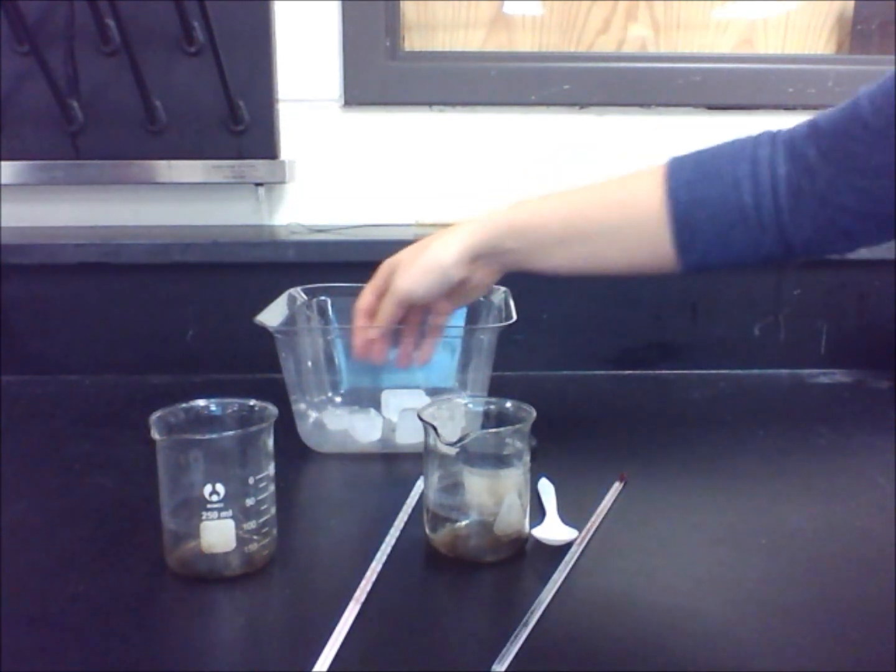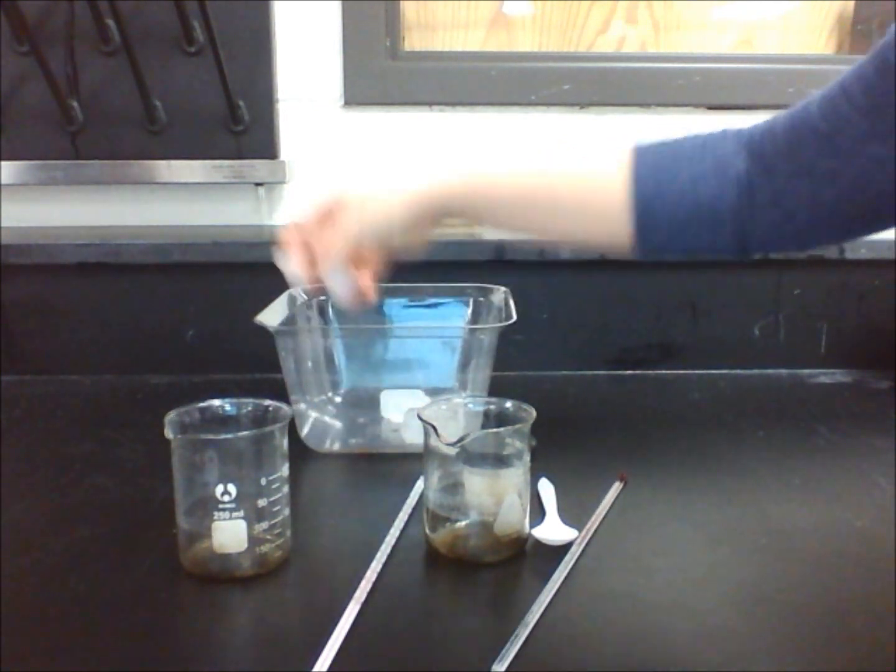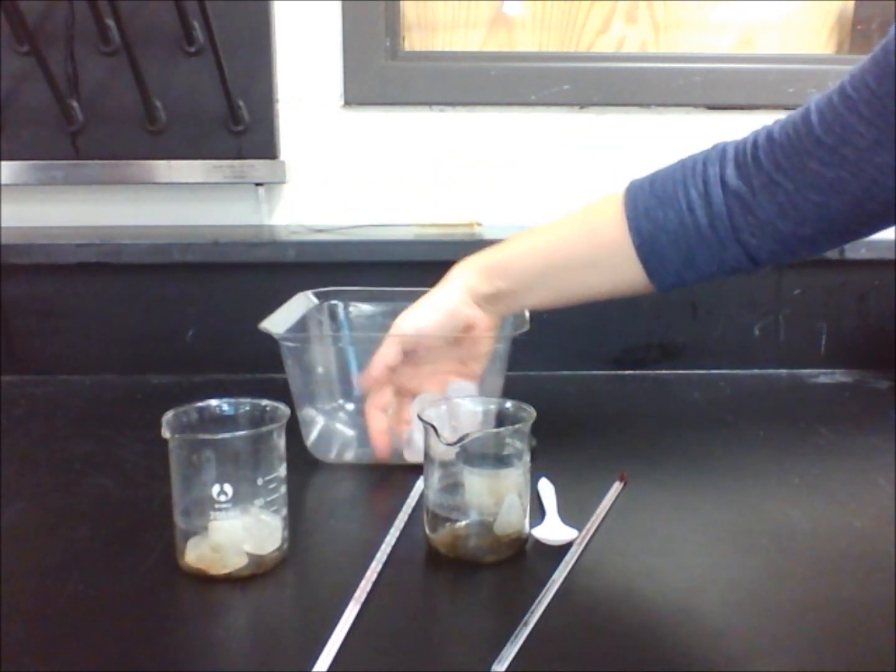First take two beakers and label one A and the other B. Fill both beakers with crushed ice until one third full.